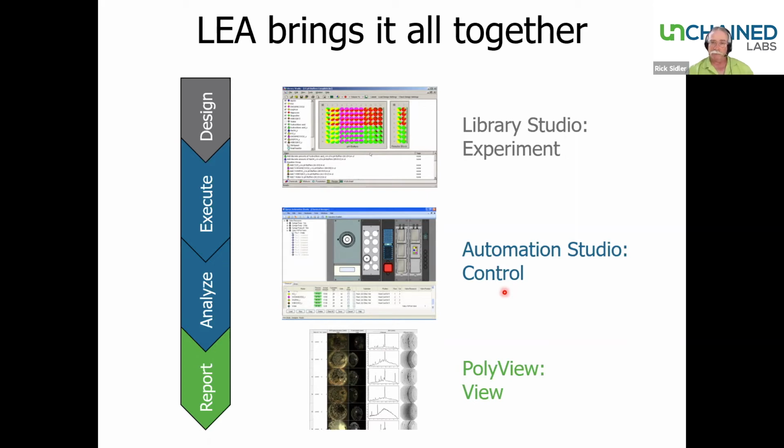All of the contextual information in the Library Studio design about the reagents, the relative amounts of those materials, the heating temperatures and stirring, all get stored into a common database. Likewise, any information generated by Automation Studio and the automated portions of the workflow are captured into that database as well. So these could be things like actual amounts of solid dispense. It could be timestamps for when each action occurs, when samples are taken for analysis, or it could be the actual integrated analyses as well.